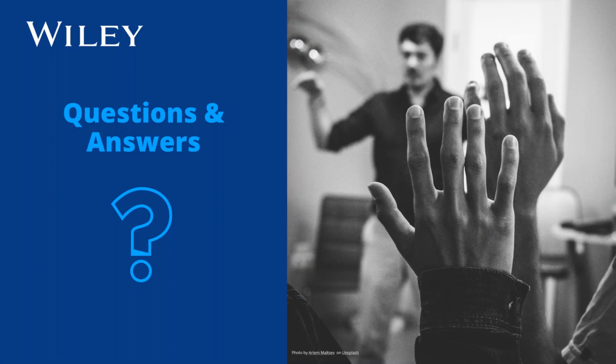Okay, thank you. Great. Is it possible to have CLS or PLS algorithms? Okay, those are the multivariate analysis algorithms. Those are good to separate overlapping peaks when there are two different components. Right now, we follow Beer's law to do quantitation, and that part will be explored later. The CLS and PLS methods, that's a totally different game plan.